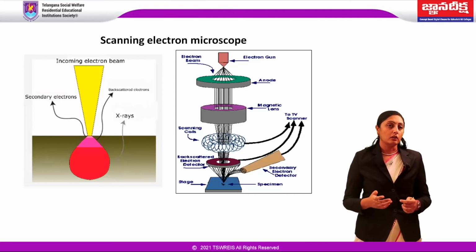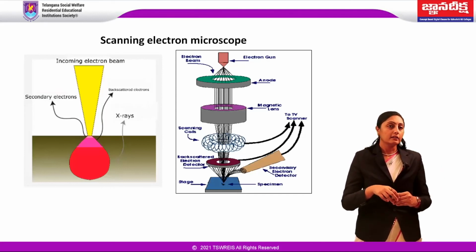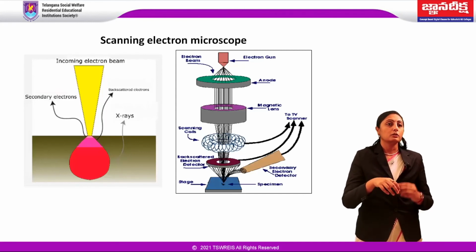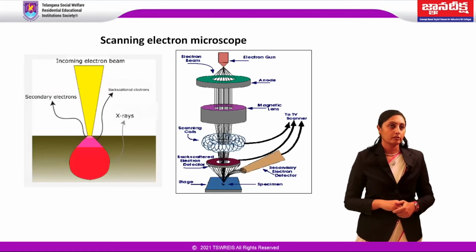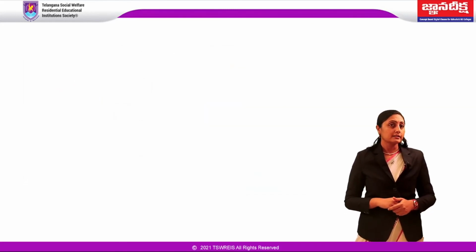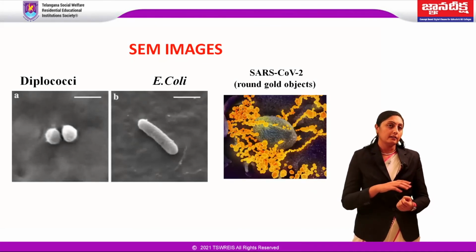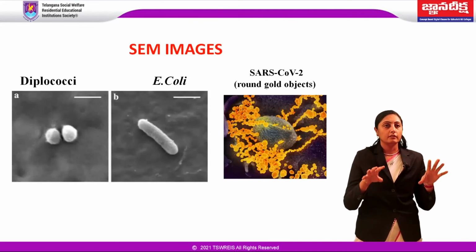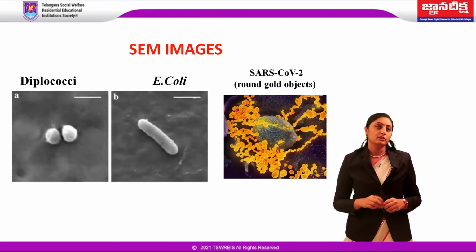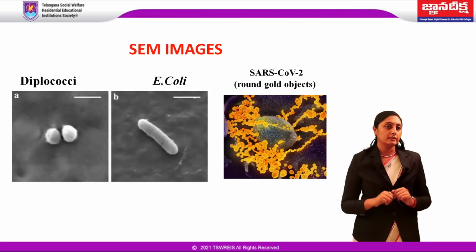Backscattered electrons belong to the primary electron beam that are reflected back. By contrast, secondary electrons originate from the atoms of the sample. Because backscattered electrons come from deeper regions of the sample and secondary electrons originate from the surface, the two deliver different types of information upon reaching the detectors. Finally, a three-dimensional image of the specimen is formed on a TV screen.